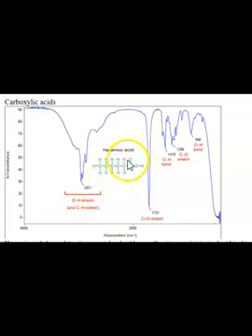This carboxylic acid has this big spread here between basically 3300 and 2500. So somewhere in here, 3300 and 2500. So that big thing there. But remember too that there's also this, which is like peeking through. There's actually 2 peaks in here, and this one is kind of overlapping the other one.